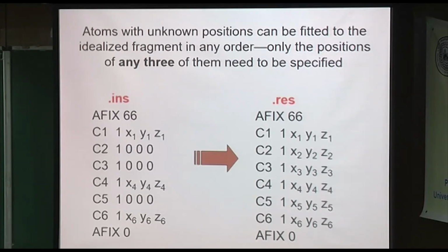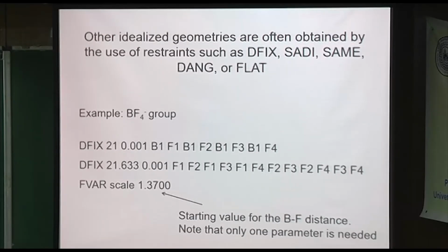And then you're talking about a phenyl ring, which is not quite as symmetrical as a benzene, right? If it's attached to something, or say a pyridine or something like that. So it's not exactly the same as a benzene, and you want to probably use more realistic bond distances for that. This assumes all the bonds are the same, and that it's an ideal 120-degree molecule. Okay. But that is built in, and you can use that.